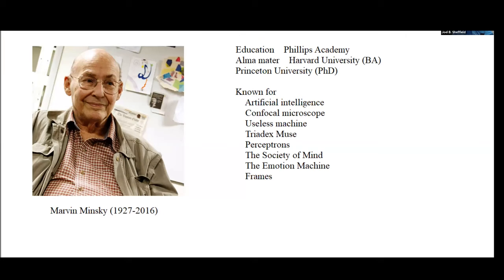So we're going to start talking about some interesting bits of history. The first thing is almost orthogonal, except that it turns out that Marvin Minsky did patent his design for a confocal microscope. 1957 is when he patented it. He had the idea of making it then, and in fact, he built this machine in his lab. I'll show you a little bit of it, I think.